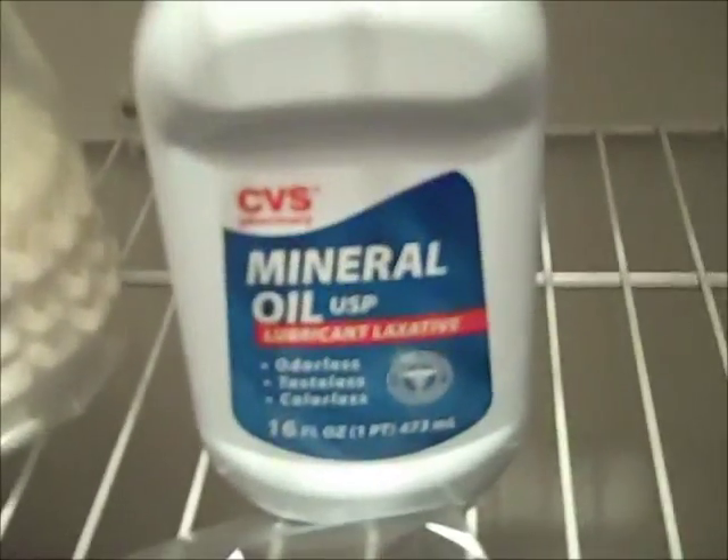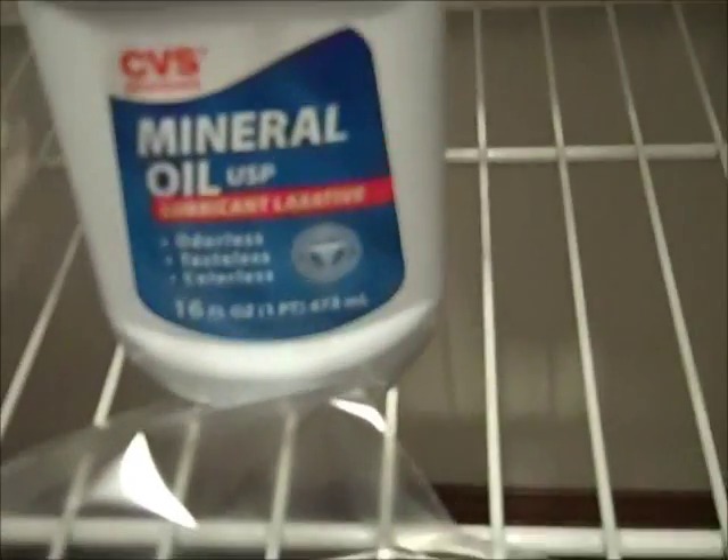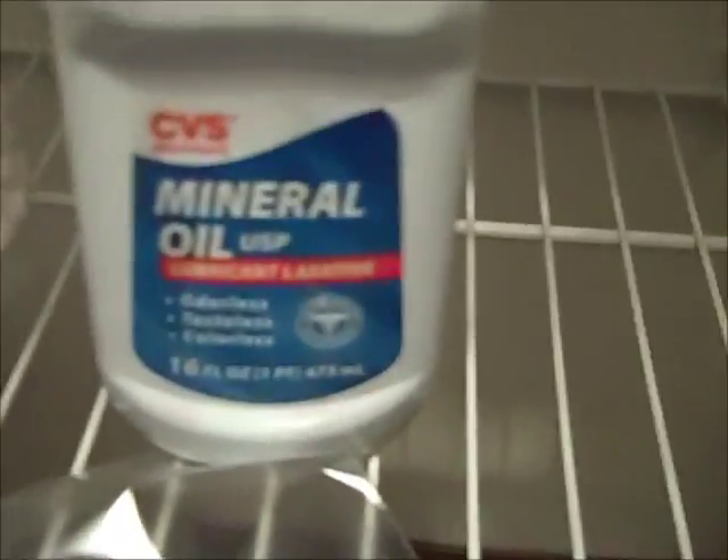And here is some mineral oil. I got it from CVS Pharmacy. It's what I use to keep my lithium under oil, as seen here. Other than that, it doesn't really see much use, to be honest.